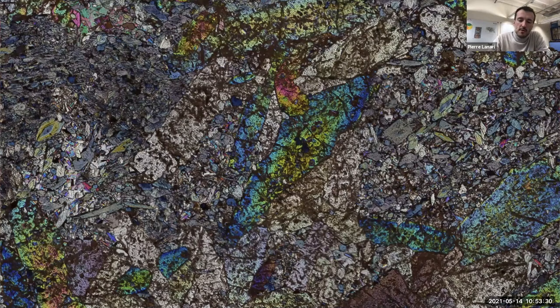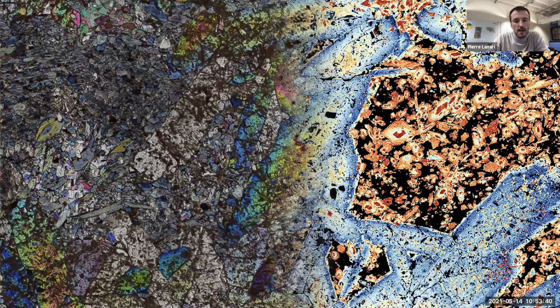But when you go to chemistry, somehow it is similar. And now we are switching to chemistry and we are looking at iron oxide content in minerals for exactly the same area. And wow, the complexity is quite high. And we have zoning in the phases. We see different phases. We have a shape of probably a form of mineral. And then we have some product precipitating in the middle. So it is quite complicated.